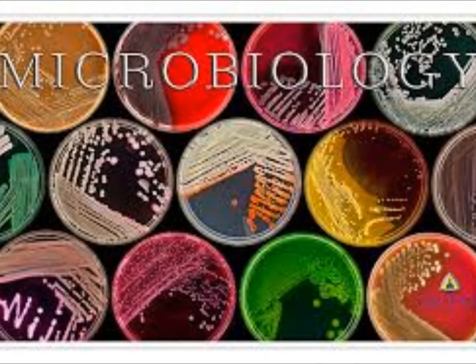What about growth in the first section, but no growth in the other two? Any growth on the plate whatsoever? If it doesn't grow, there shouldn't be any colonies anywhere.